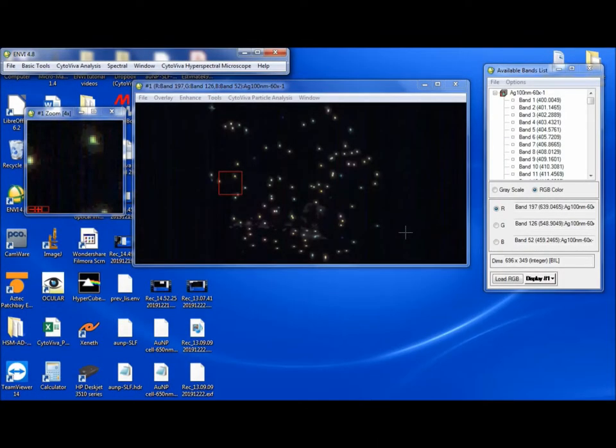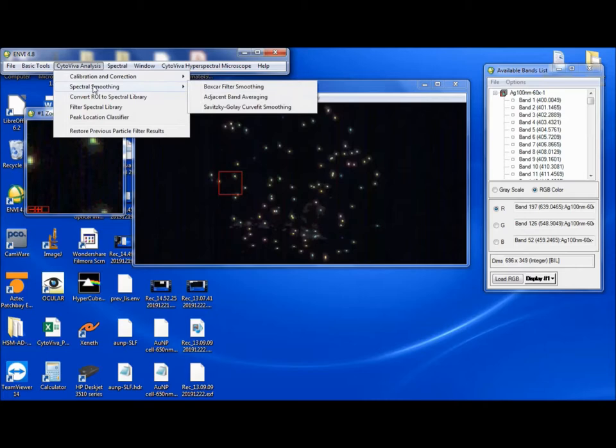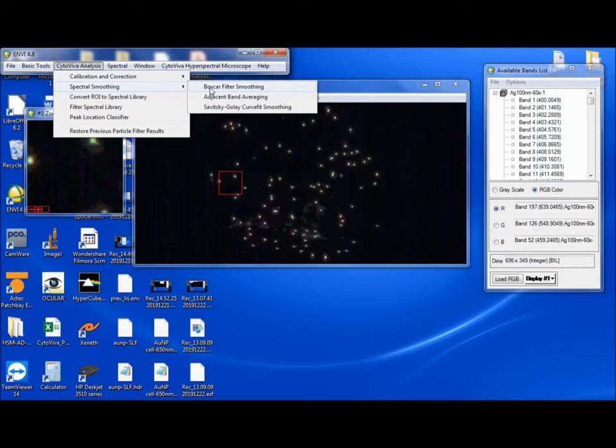Hello. Today we're going to go over the Cytaviva analysis tool for spectral smoothing. Spectral smoothing is a function that we put into the software to smooth out the spectrum. There are three different ways to do this in the tool.